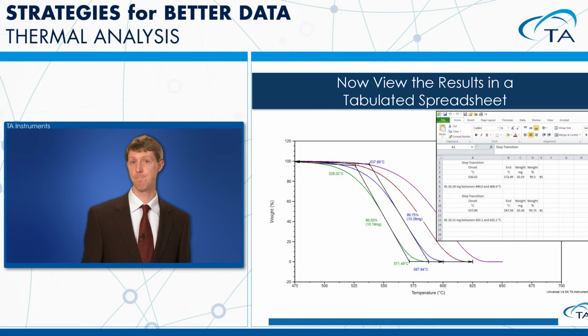If you're collecting, let's say, 10, 20, 30 different formulations, you have a multitude of experiments, you're looking at glass transitions or peak integrations on each one of those 10 or 20 plots. Instead of just jotting them all down and then retyping them into Excel, you have the ability to put them into an overlay and throw those results over into an Excel spreadsheet.